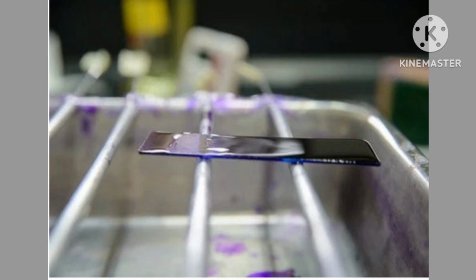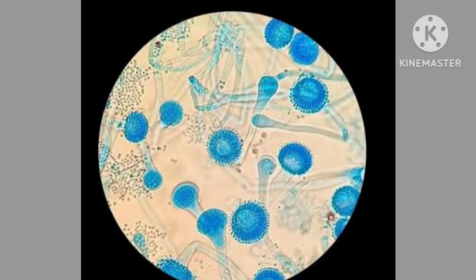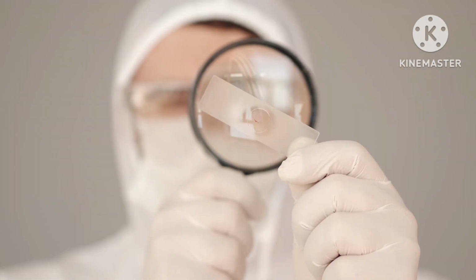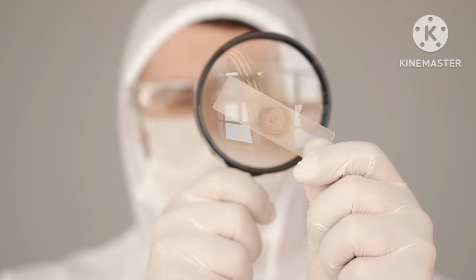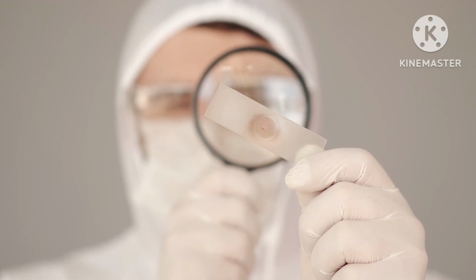Microbiology. In microbiology, the microscope helps us observe microorganisms. For example, after staining a smear, bacteria may be seen under the microscope. It also helps in examining fungal elements in some specimens. So, in microbiology, the microscope gives the first visual clue about infection.